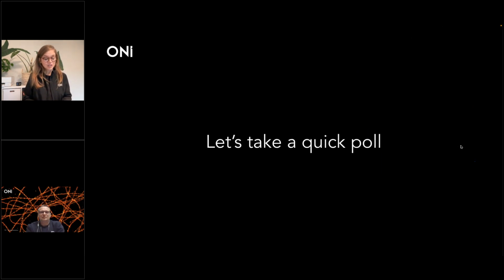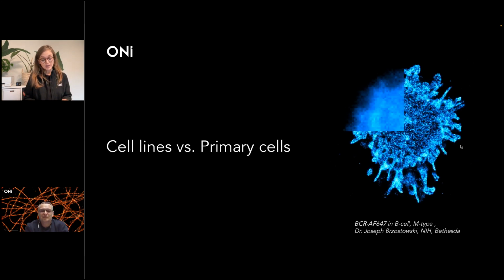My first question for you, Stefan, is a little bit more related: how does a general cell staining protocol vary if we do high resolution dSTORM compared to other traditional immunolabeling with confocal? Is there a major difference between these two? Yeah, so this is a very interesting question. Basically, the answer to this will be no.